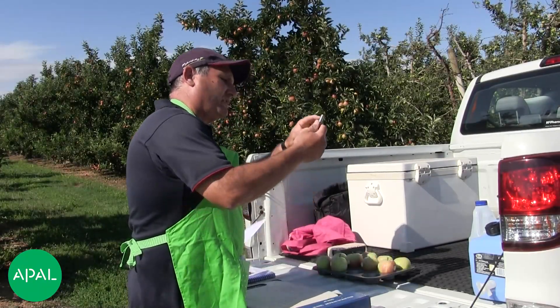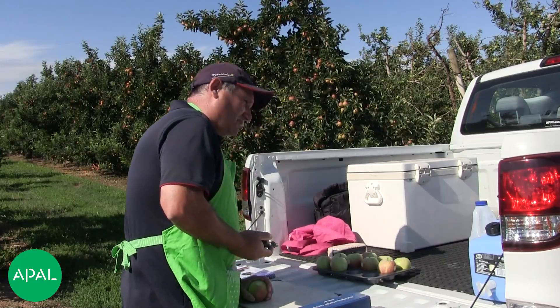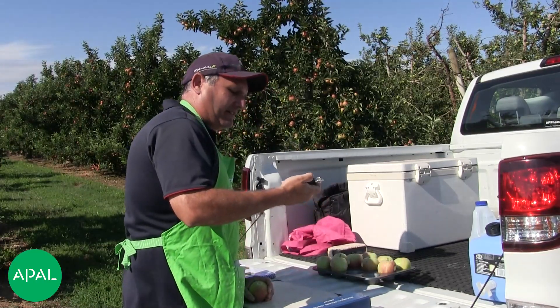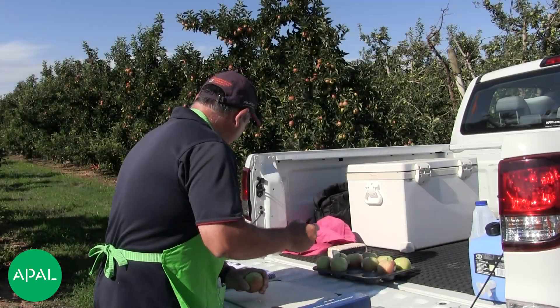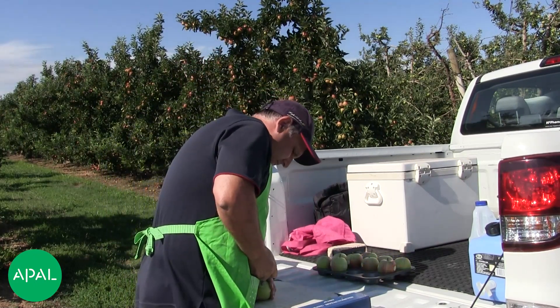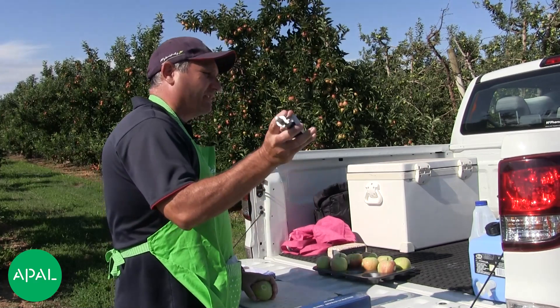There's a little line there to show you how deep it needs to go. Make sure the apple is firm, then rest your hand on your stomach, sit the penetrometer on the apple, push until it reaches the line, then take it off. That gives a reading of 8.5 kilos. Write that down as pressure one, 8.5. Then reset it to zero, flip it over and do the other side — that one's showing 8.